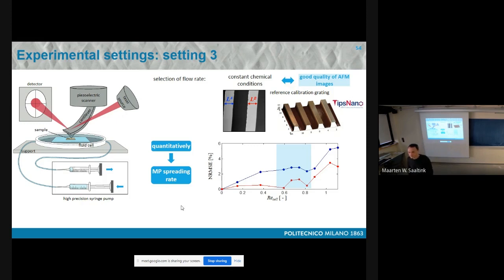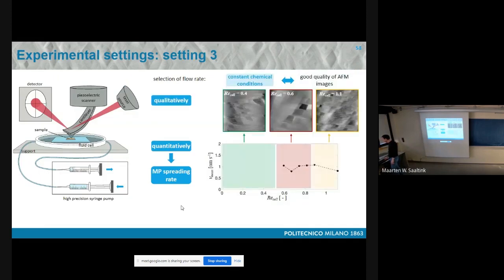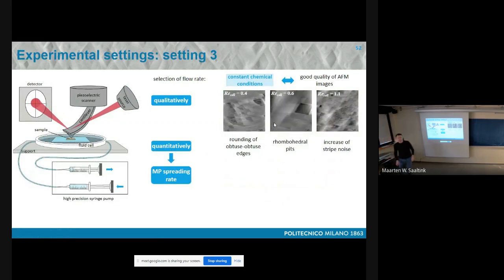Second question. When you consider the experiment with the flowing water, do you expect any influence of the instrument in the flow? Well, let's say it was these images like here. You have different values of the Reynolds number, and this is the type of images that you get. So it's really an influence of the velocity. Would you say it's also influenced by the velocity of the instrument sampling? It's a combination of the two.